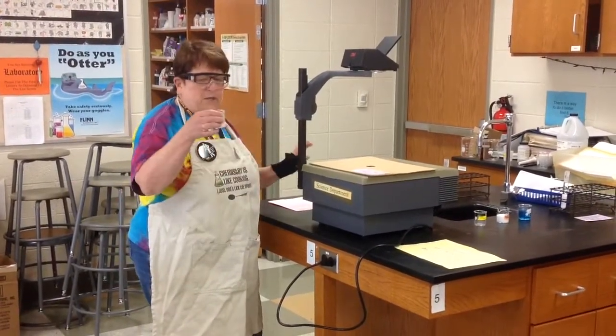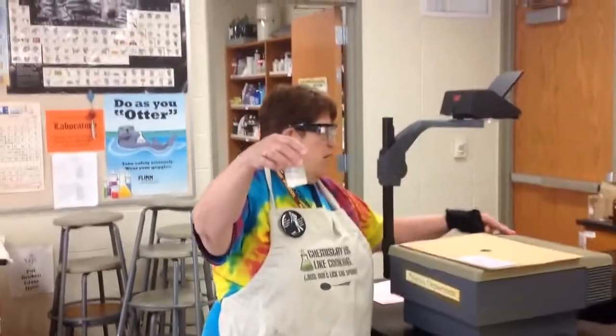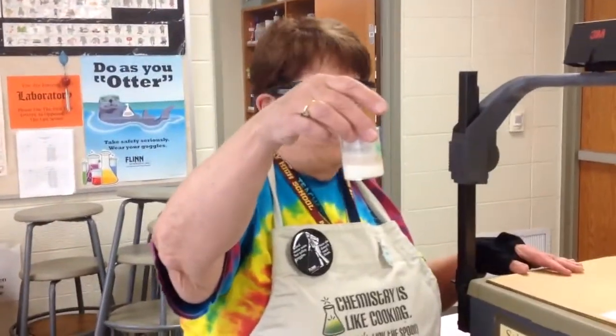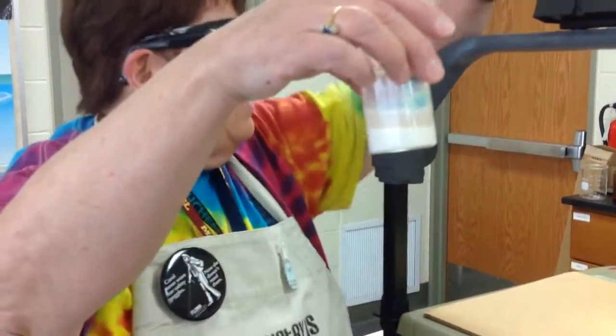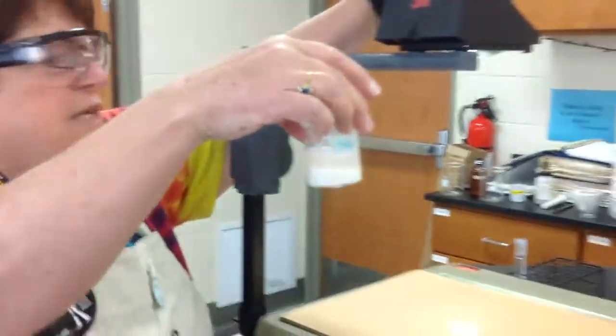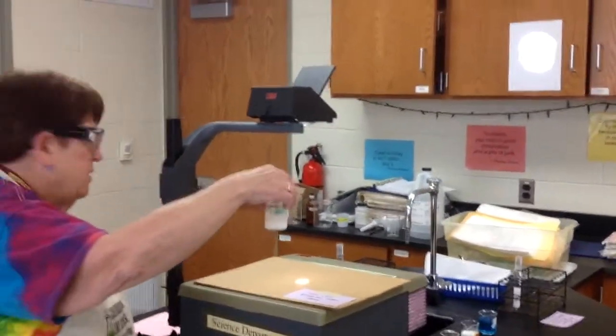So in this beaker, I have some clay. Are you close enough to see this? Clay and water, a clay-water mixture. And this is not one you will be looking at. But if you see a couple things, the particles are settling out in here.